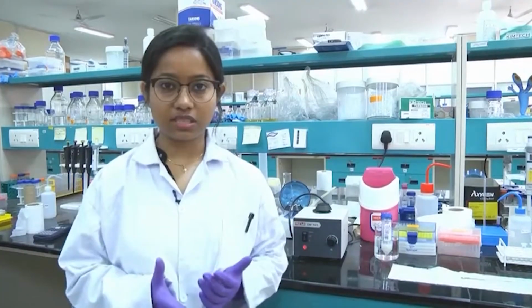First you give an overnight culture of around 15 to 16 hours in LB media, where you grow your bacterial cells, mostly E. coli. The strain of E. coli will be one which has an expression system. We chose the BL21 lambda DE3 strain, which has the lac operon system, where you can express your protein when you provide a particular inducer, in our case IPTG.